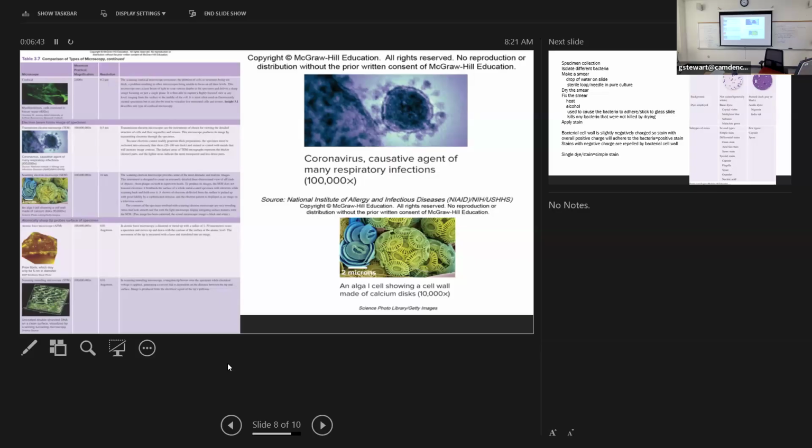Later, the specimen has to be sliced, and so you are viewing the specimen in cross section or longitudinally. Now, of course, we have the capabilities of having a computer that can reassemble that for us, and then you can rotate it and look at it in 3 dimensions.